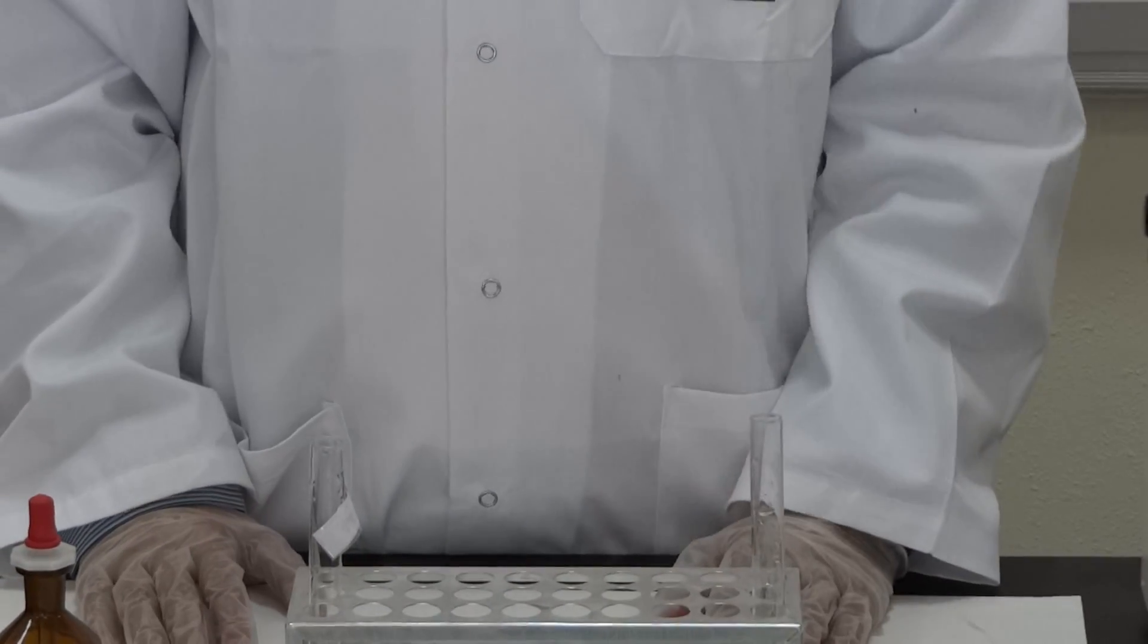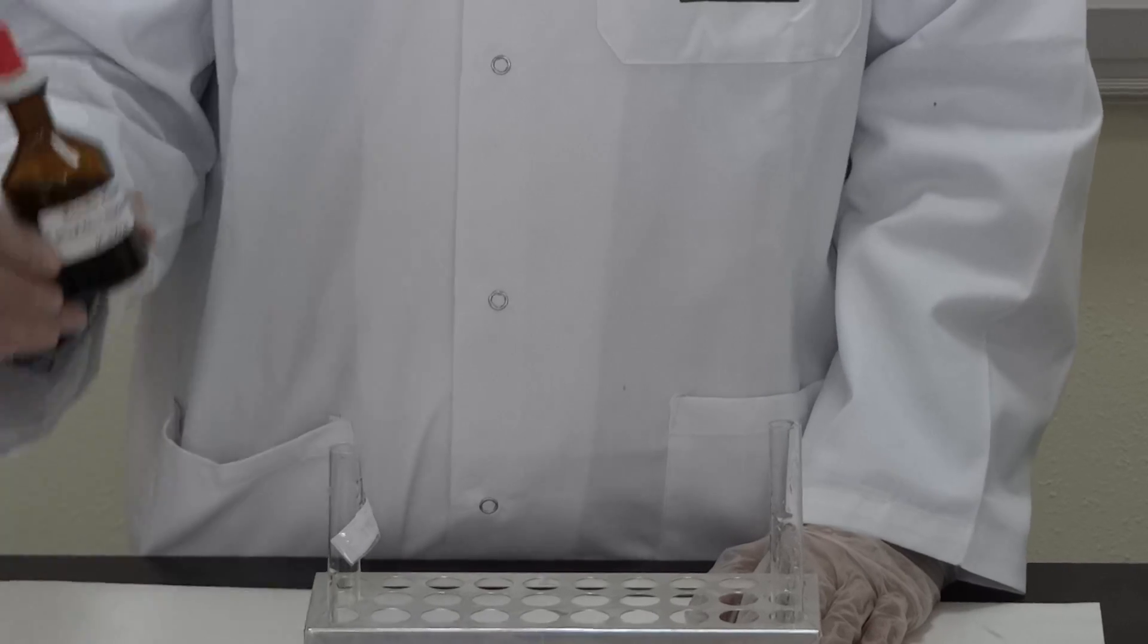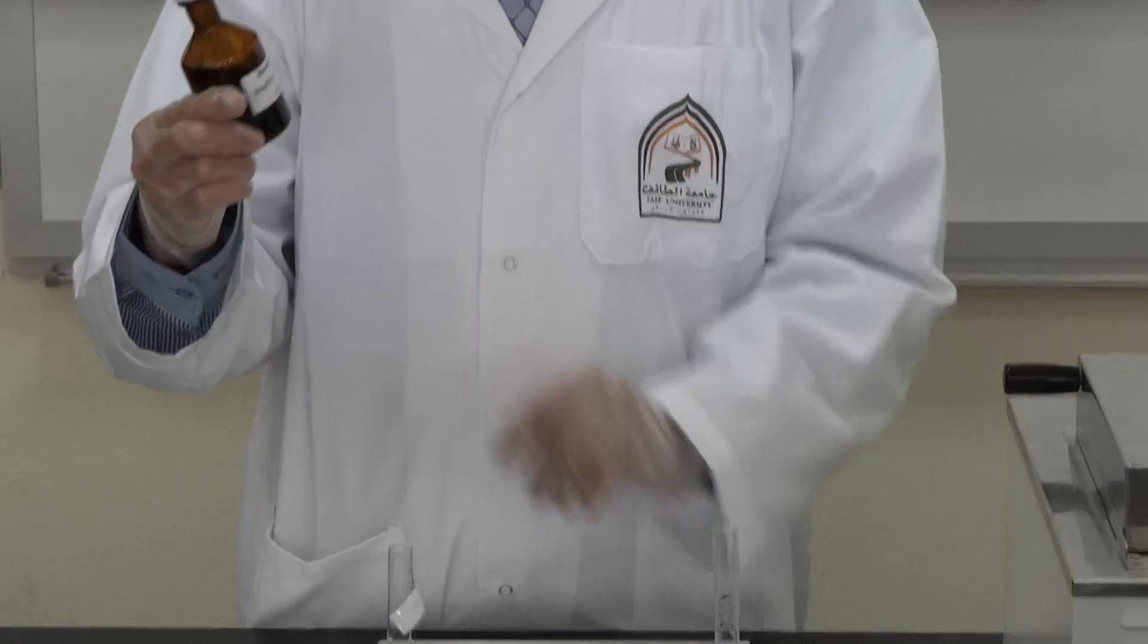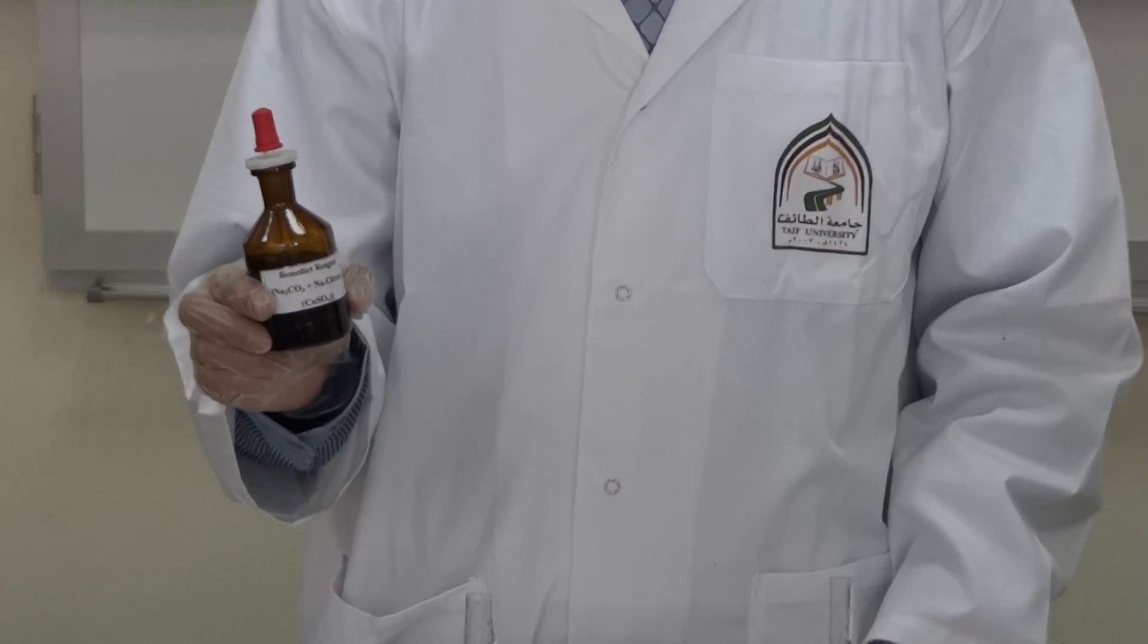How to do Benedict? Just what you need is a Benedict reagent, which is sodium carbonate, sodium citrate, and copper sulfate.